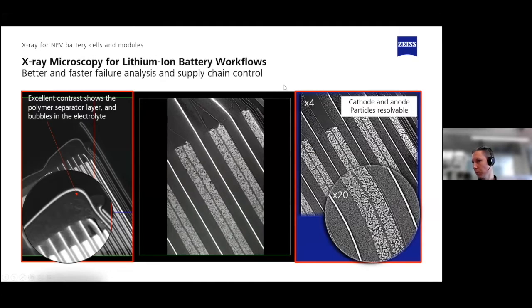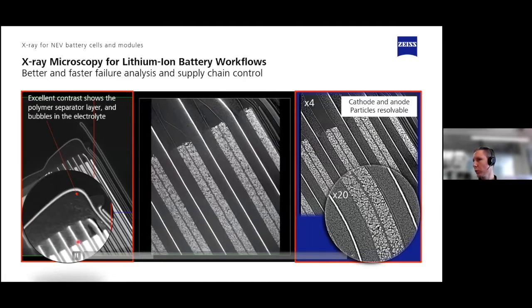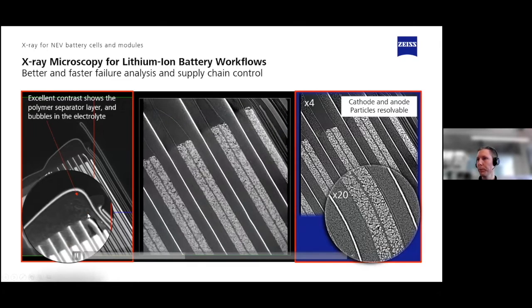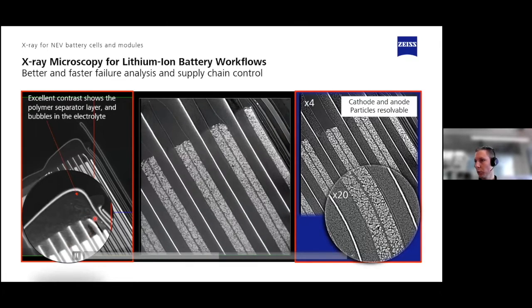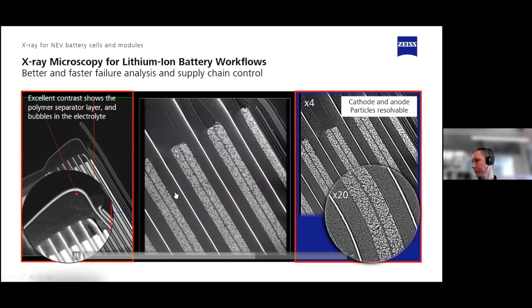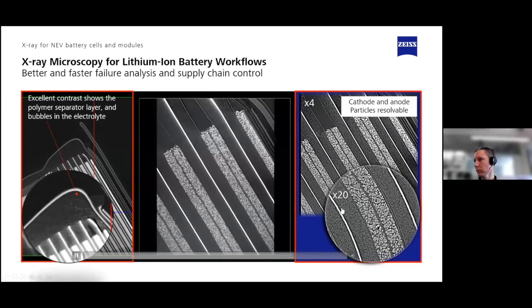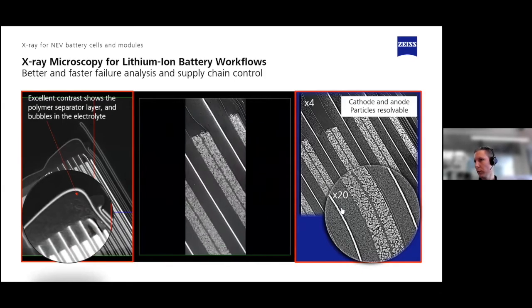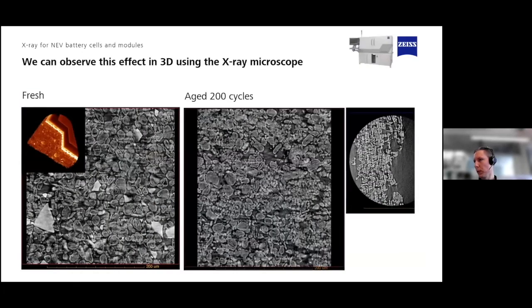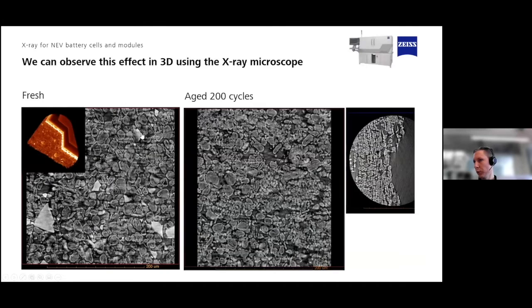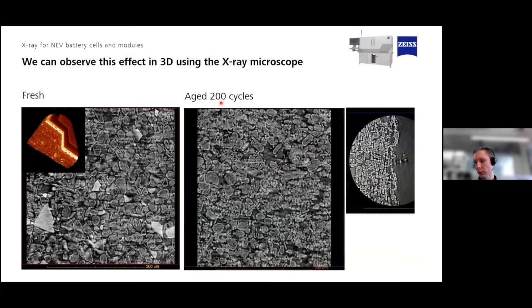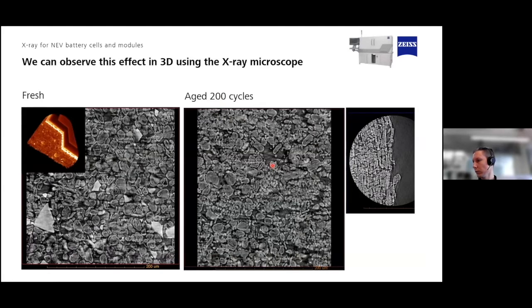Here's another example of the same part. In this image you have really good contrast — you can see the separator layer made of polymer, bubbles in the electrolyte, and all the single particles. With that, it's possible to have a look at, for example, the silicon particles in your cell. You can see a fresh cell image and the same region in the same cell after 200 cycles of aging. As you can see in this example, there are no longer any silicon particles visible.